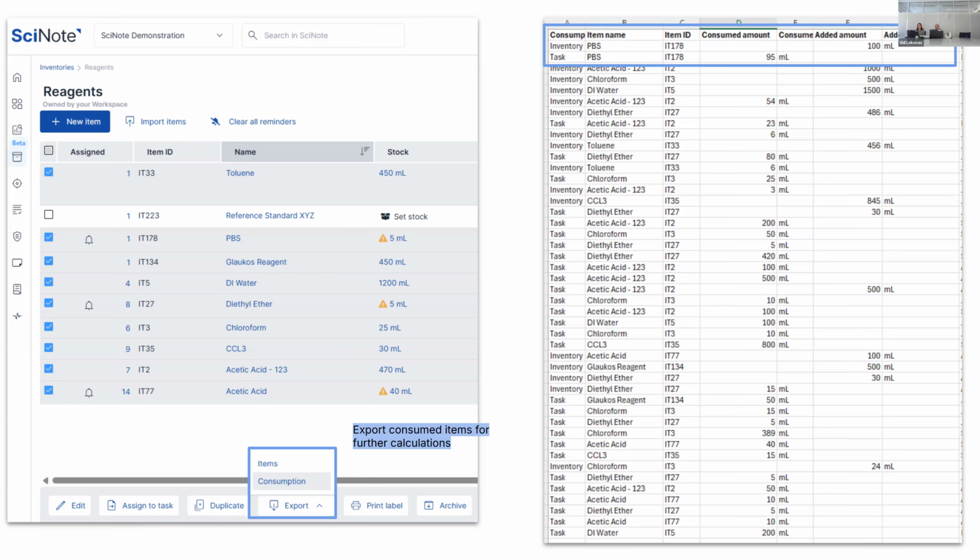Yeah. Okay. So I moved the slide while Blaszka was explaining, but yeah. This is why I also want to show these inventories. It doesn't matter if you have different teams. They should be able to find a way to use SciNote inventories because they are very customizable. Everything you see on this screen was custom created for this specific inventory, and another team can have a completely different inventory. So it doesn't have to be the same one. But it's important that they're using the same system so that you can track and create this long-term traceability that Blaszka was also talking about now.